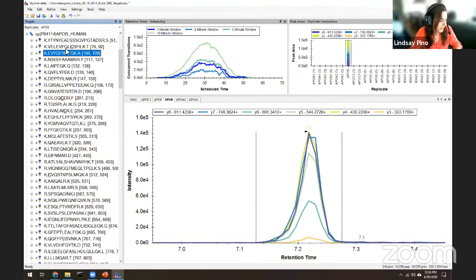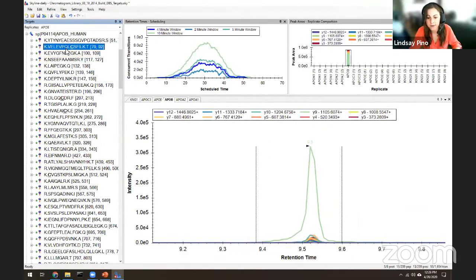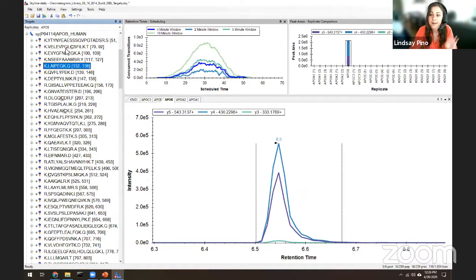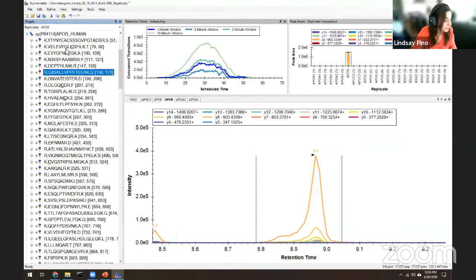If we select 5 peptides to quantify a big protein, and there's lots of good flyers, is it important to select them from the whole length of the sequence, like the beginning, middle, and end? That's a great question. If you've got a giant protein and a lot of peptides to pick from, and a lot of them fly well, you might want to try to cover the length of the protein. You might see interesting things like the question we had before, where some peptides at the N or the C terminus of the protein might have different quantitative trends that would signify proteolysis or degradation of that protein. If you have a lot of options, yeah.